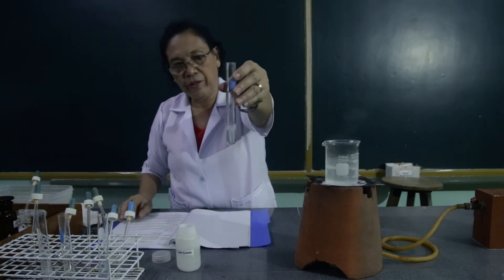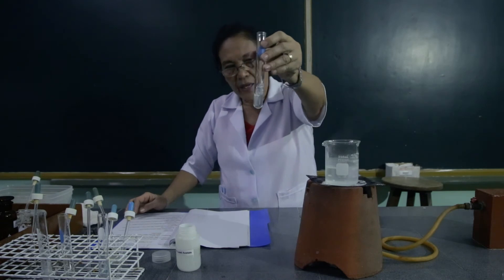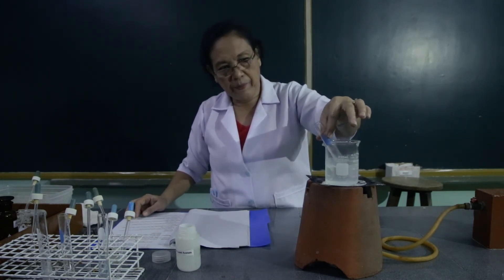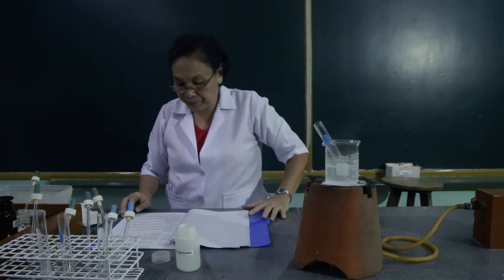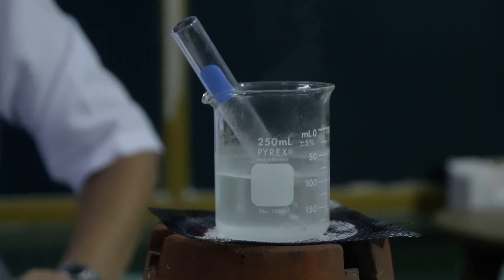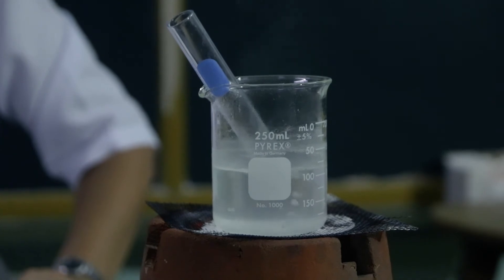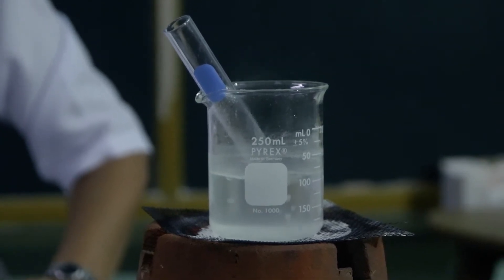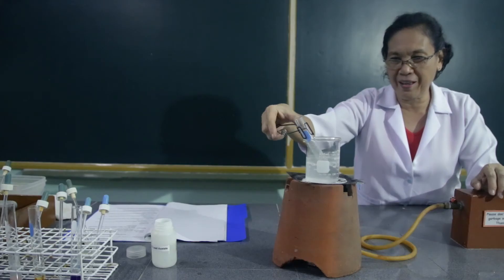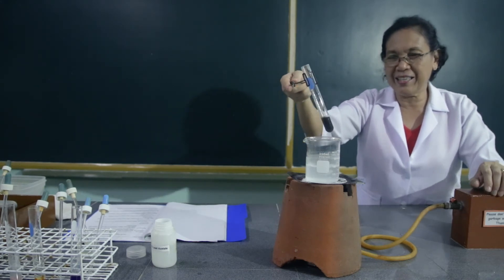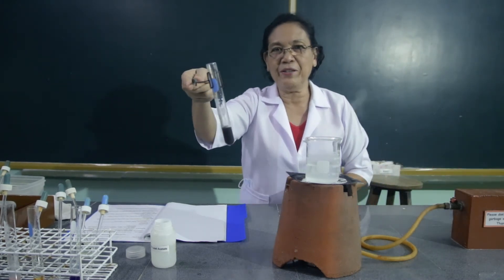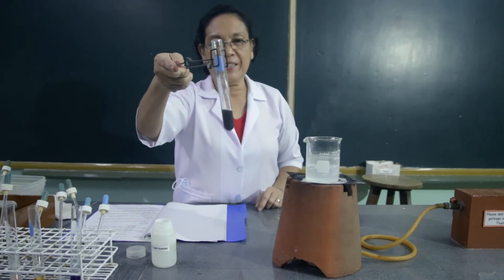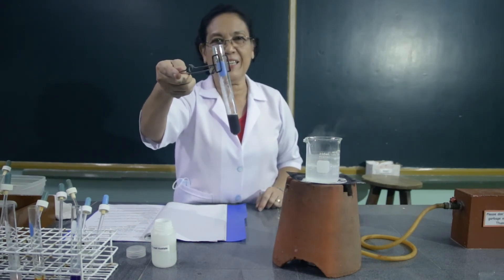Then we're going to place this into the water bath for 2 minutes. I want you to observe what happens to the color after heating or boiling this for two minutes in the water bath.